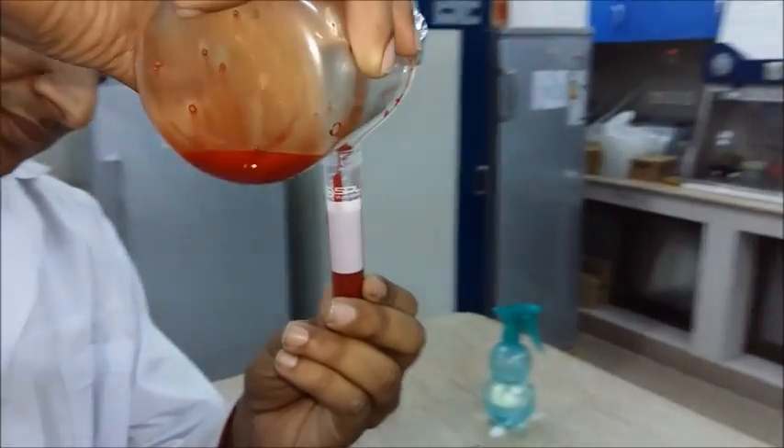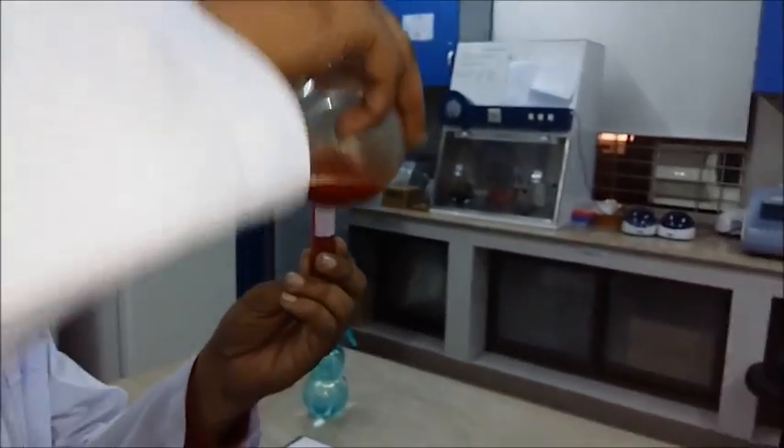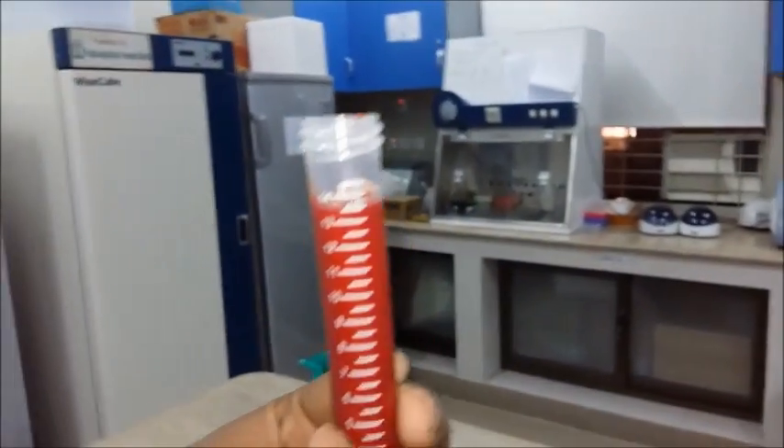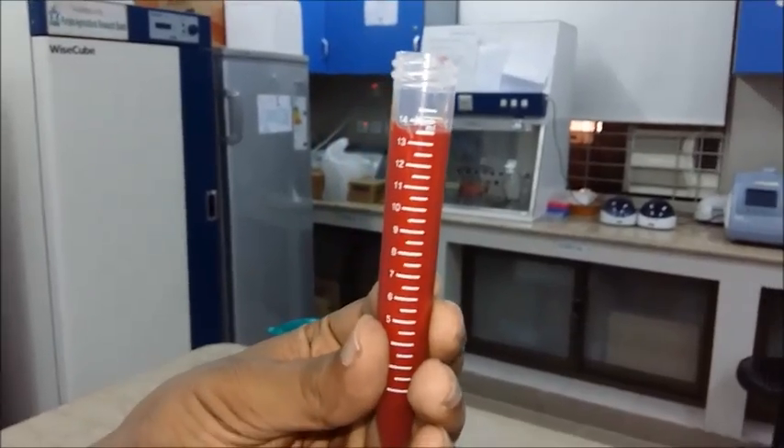Dr. Furkan is pouring it now. Make sure that the measurements are correct, otherwise the final percentage won't be proper and the whole test might fail.